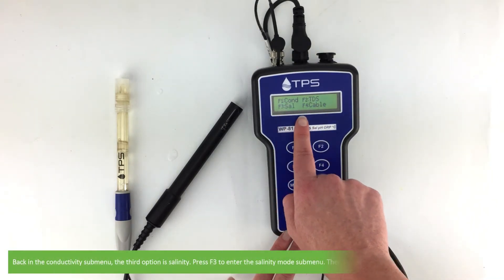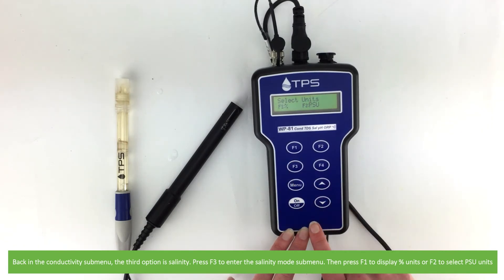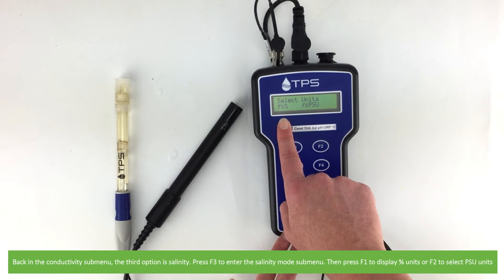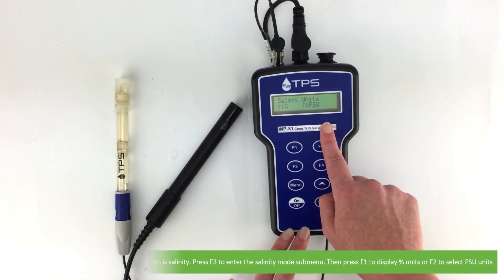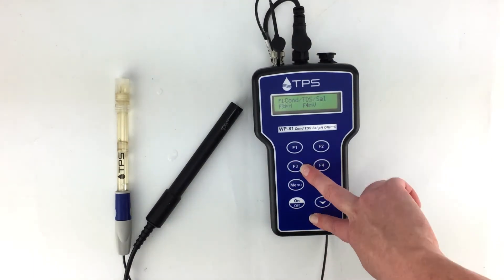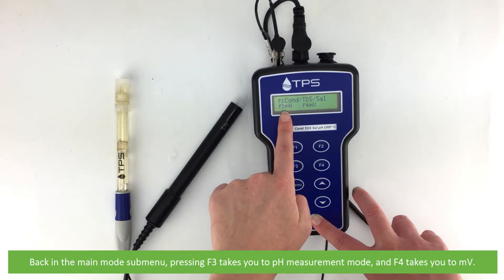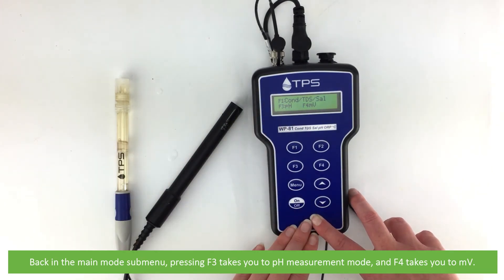Back in the conductivity submenu, the third option is salinity. Press F3 to enter the salinity mode submenu. Then press F1 to display your results in percentage units or press F2 to select practical salinity units. Back on the main mode submenu, pressing F3 takes you to the pH measurement mode and F4 takes you to millivolts.